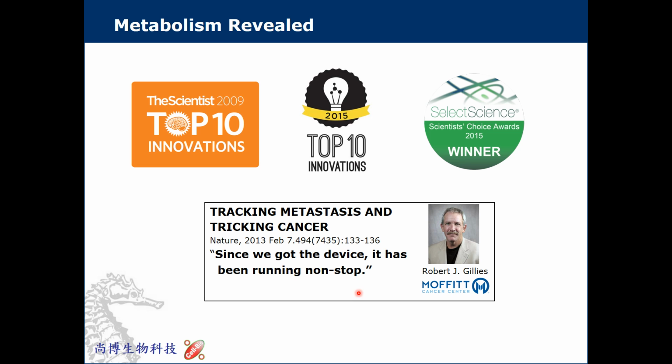Then following is a guide to show you, if you want to start a Seahorse analyzer, which consumables you need to prepare, how to prepare your cell well, and the details you need to notice.